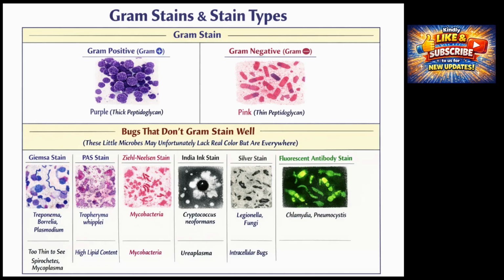Acid-fast stains, such as Ziehl-Neelsen carbolfuchsin, detect bacteria with mycolic acid-rich, lipid-heavy cell walls, notably Mycobacteria and the partially acid-fast Nocardia. The high lipid content resists decolorization with acid alcohol, allowing the stain to remain within the organism while background cells are decolorized. Auramine-rhodamine fluorescent stains exploit the same lipid-binding principle but increase sensitivity, allowing rapid screening. The acid-fast property also correlates with slow growth and resistance to common antibiotics, which is often tested in board questions.